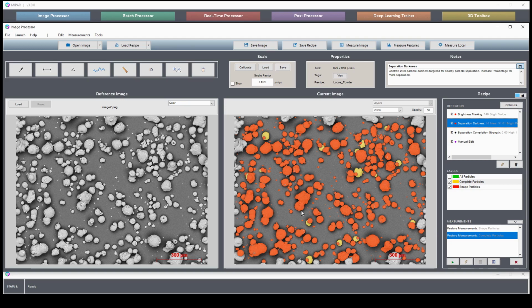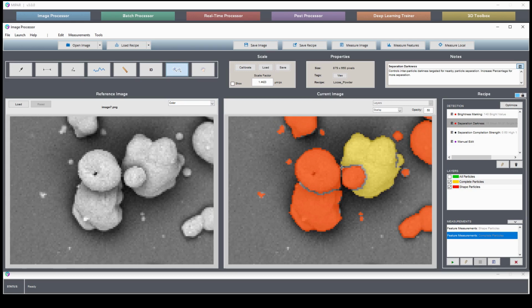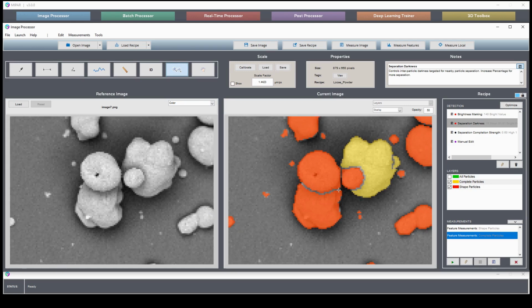of this application, where, as I mentioned, features that you might think should be separated should be treated as one unit, and it's only when significant shadowing is observed at particle boundaries, such as this, that features should be cut.